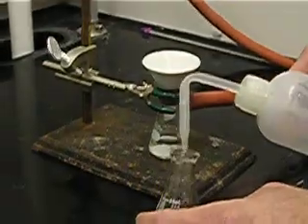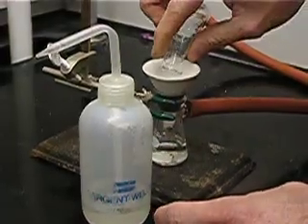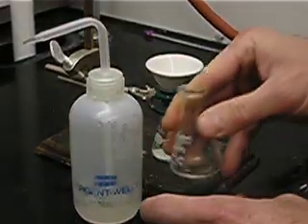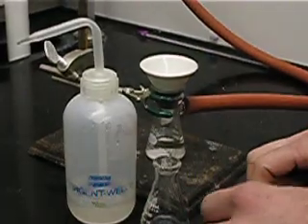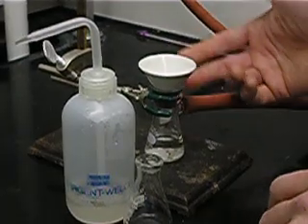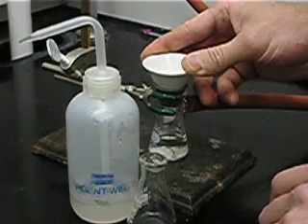We can use another one to two mils and do it again — a third time — never using more than one to two mils for each wash. Three washes is typically satisfactory. We leave the solid on the Hirsch funnel so that air can continue to be drawn through it, further drying the solid.